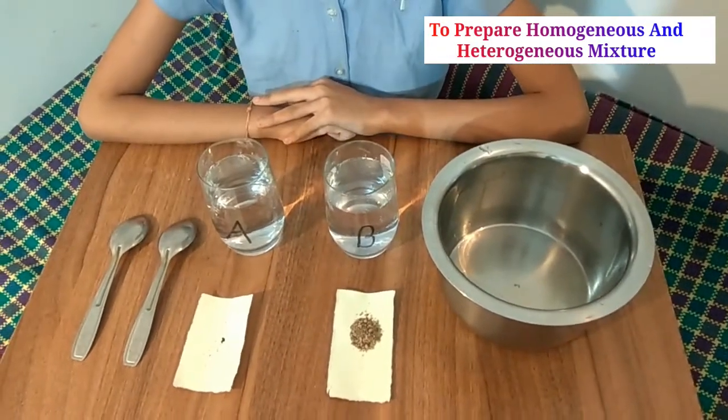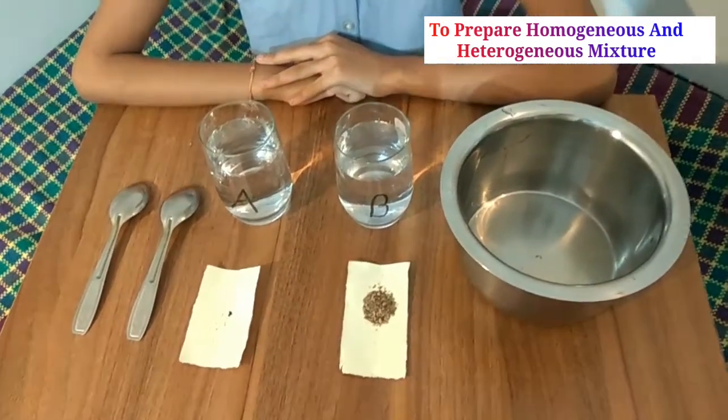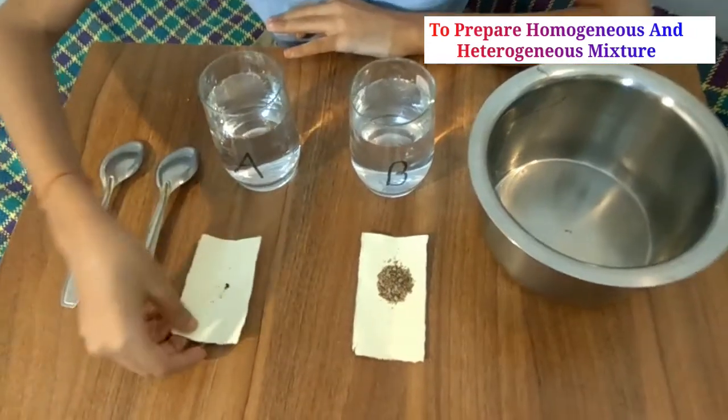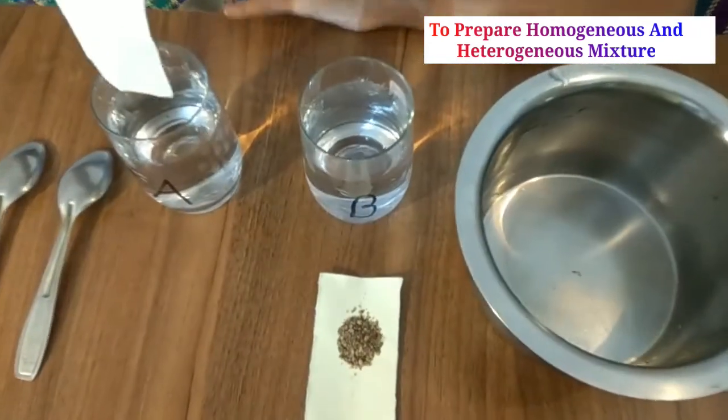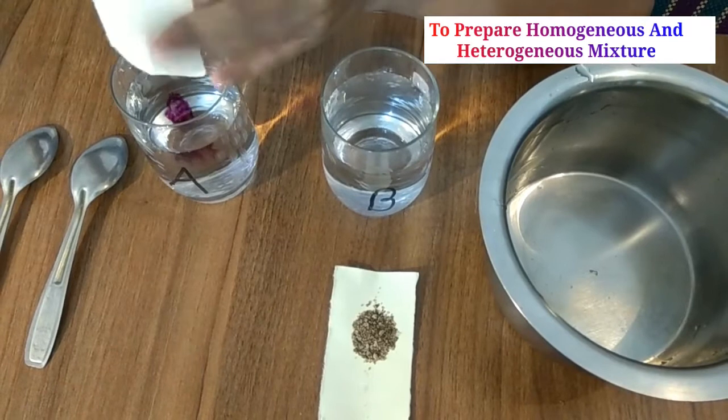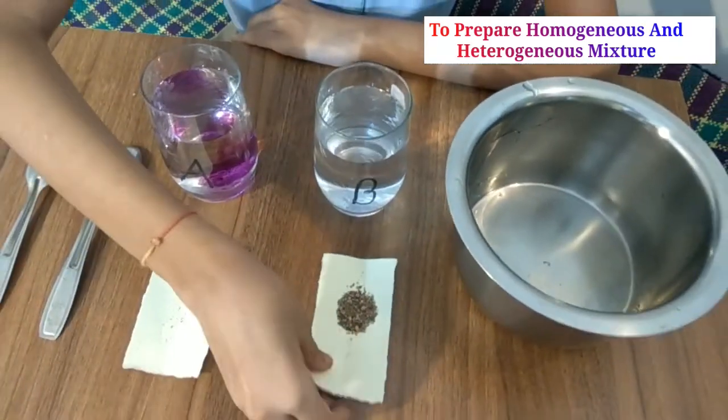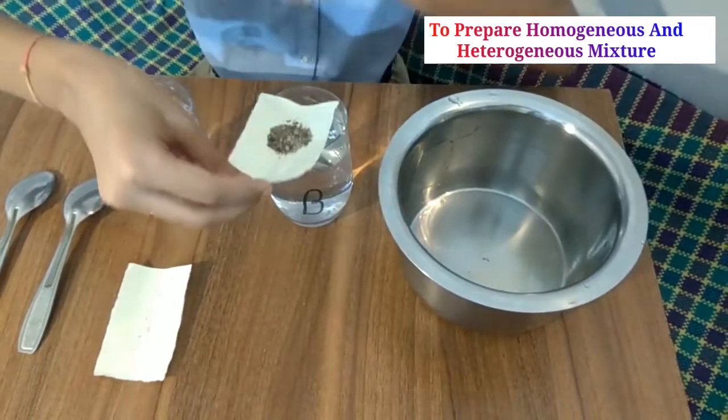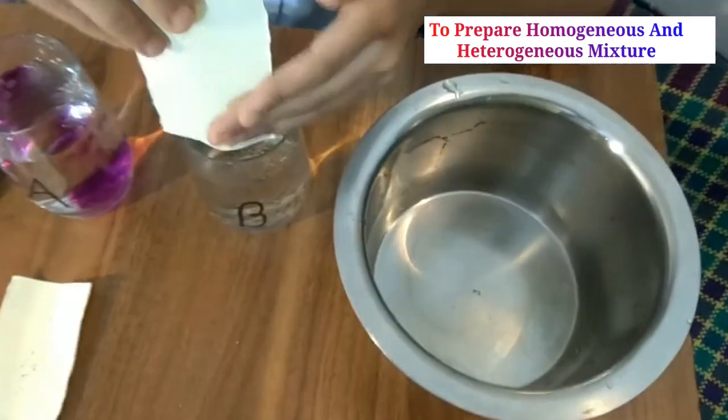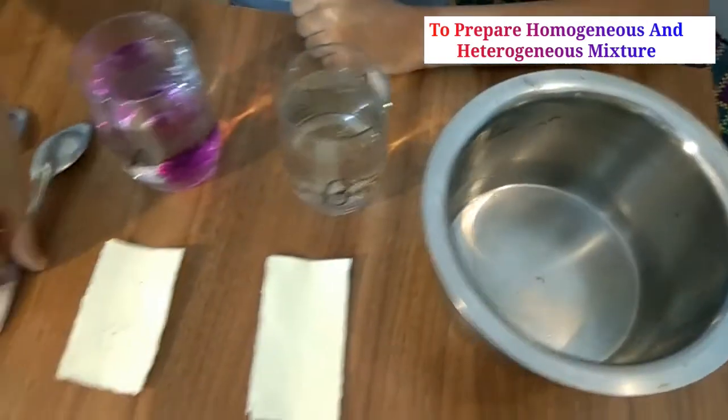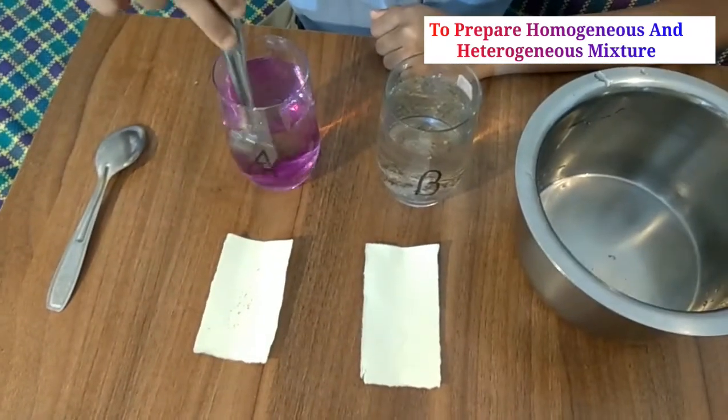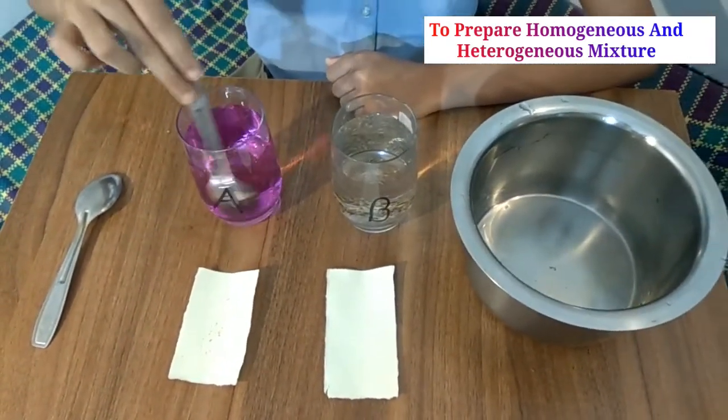Pour potassium permanganate in glass A. Pour sand in glass B. Stir with the help of the spoon.